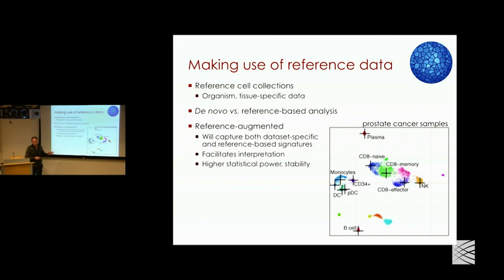You get some hints, and you also get an increase in statistical power, because if, let's say, the blood sample separated B cells clearly, then we already have an axis that allows us to separate B cells, and most likely they'll get pulled away from the rest of the distribution, even if there are not a lot of them. Okay, now you notice that these 3 clusters, for instance, did not get any kind of reference mapping.